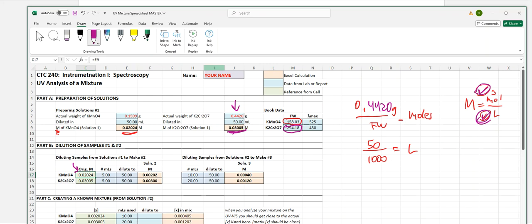In order to get Excel, if it's not there, to reference that, you just simply hit equal, and I'll do it. I'll override it. It's not a big deal. I'm just going to hit equal into that spot, and then I'm going to come up here and click on the number that I want it to reference, and then I hit enter. So that is how you get Excel to reference another cell based on a value that might be present.